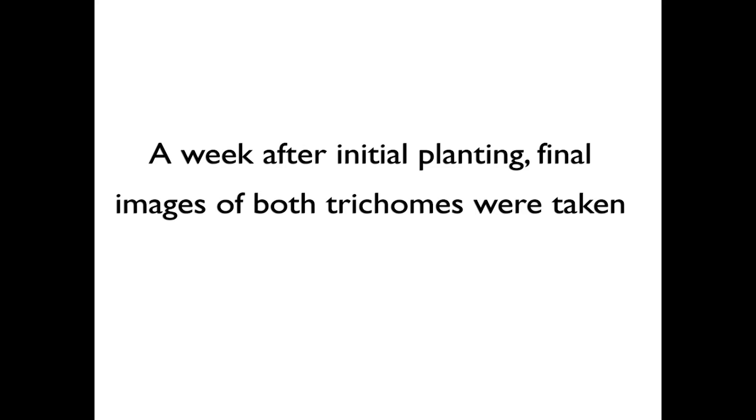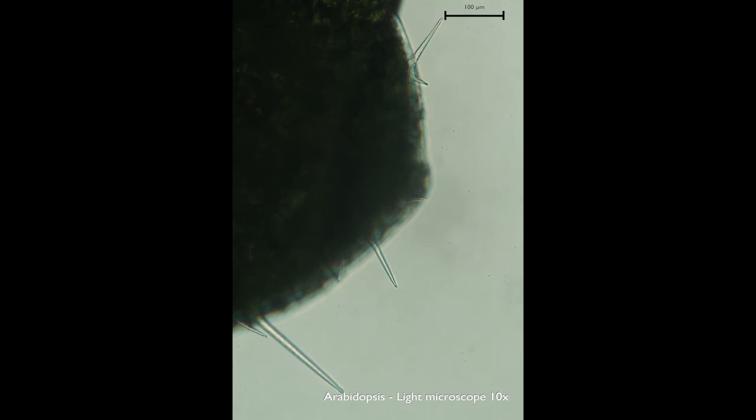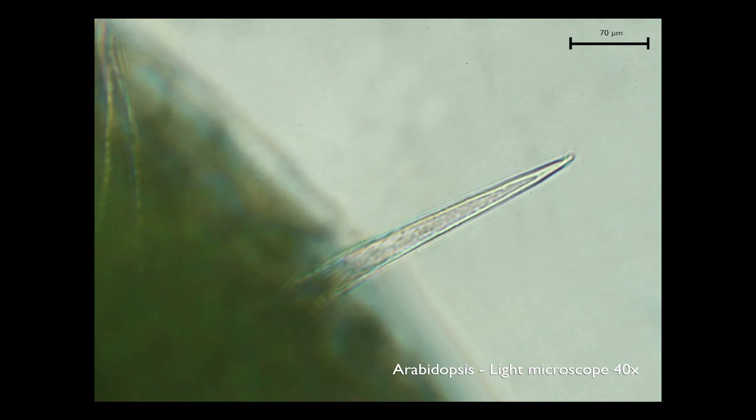A week after initial planting, final images of both trichomes were taken once again. Following are the arabidopsis trichomes on the final day.